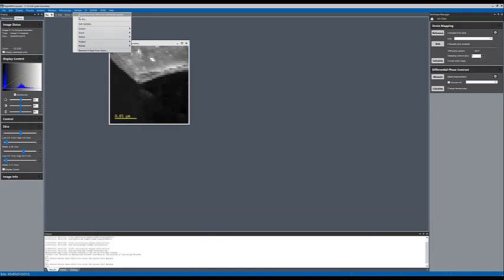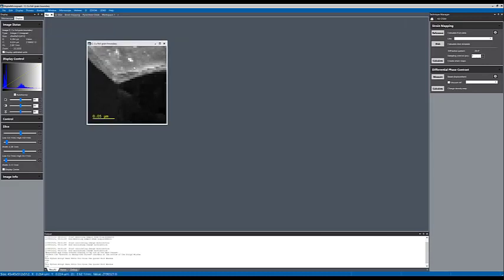Okay, that is what I wanted to show you. I think that is it on this data set. You have this data in the link that I sent you. You can open this in the free version of the software, use the picker tool, and extract the images and generate some bright field, dark field images as well.